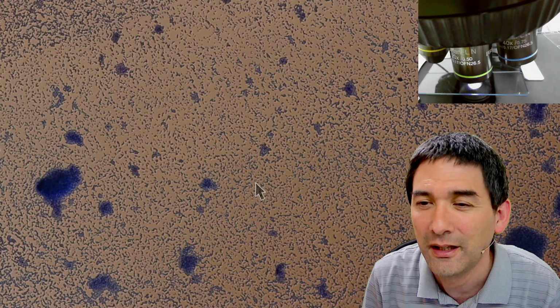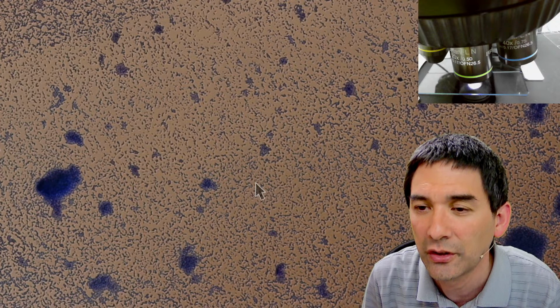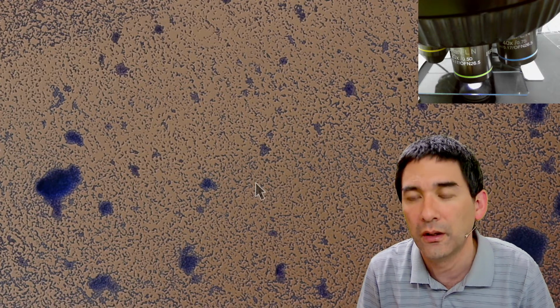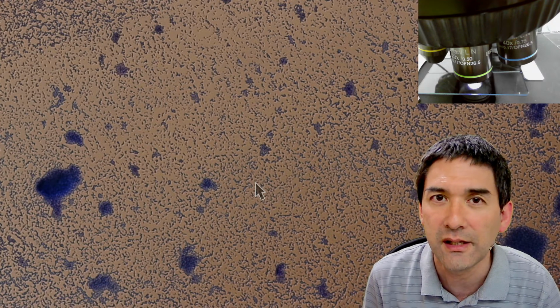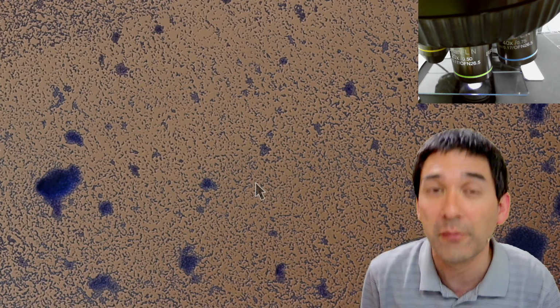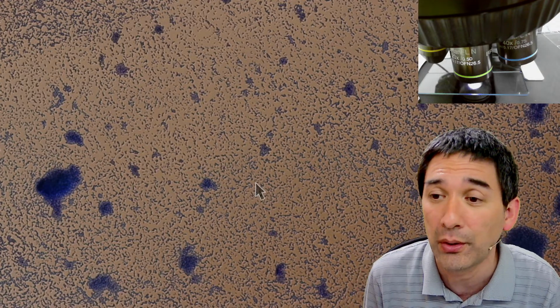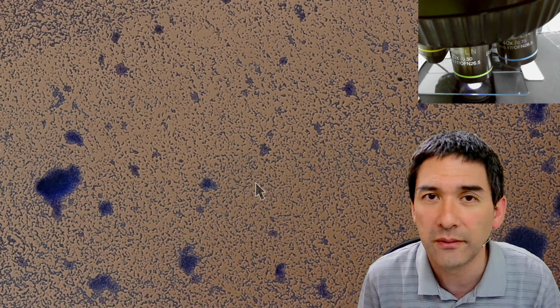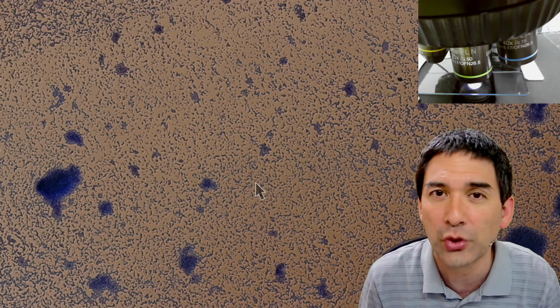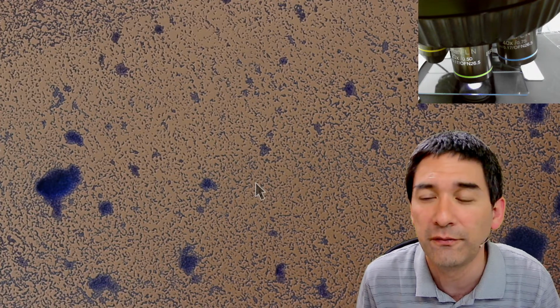Is it true that two microscopes can have the same optics, but one can be more expensive because of more features? Of course, as a matter of fact, this is definitely the case. Often microscopes are manufactured by the same company and rebranded, and sometimes you even use the same parts. So sometimes there are not even that many different optics, they're reused on different microscopes, and the microscopes differ, for example, in the features that they have.